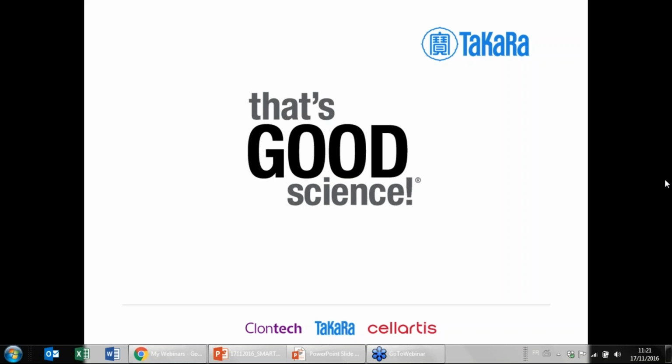Is the TCR profiling kit compatible with other species? No, the kit is very specific. The mouse kit cannot be used with the rat kit, because the sequences of the primers are very species specific, so it's not possible to just take another primer and use it for TCR. If you are working with human, you will need the human TCR kit. If you are working with mouse, you will need the mouse TCR kit, and so far we don't have one for another species.